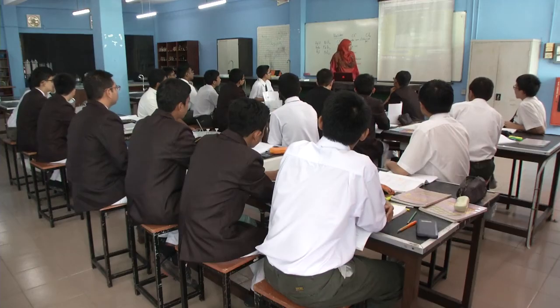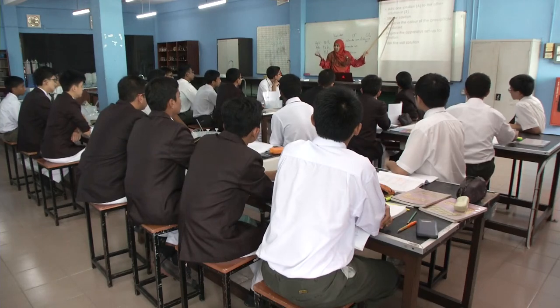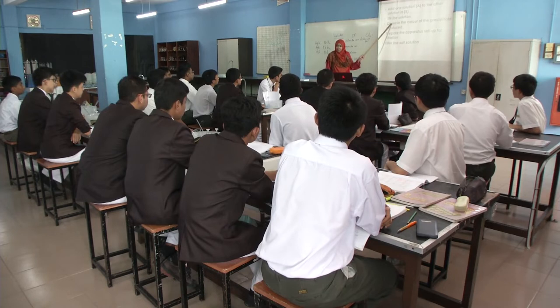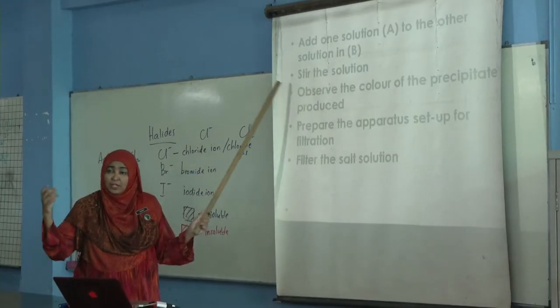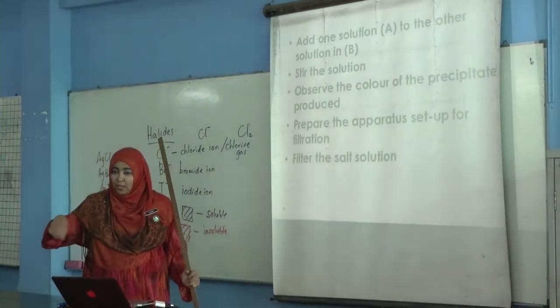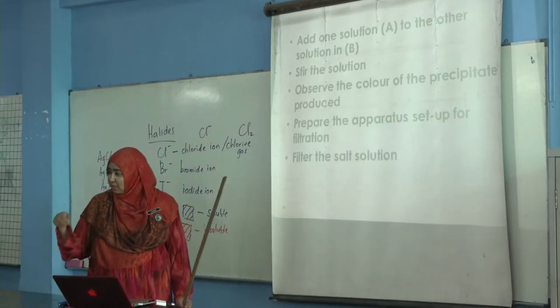So now what you're going to do is, in your basin, you have two different solutions. Okay? Now, you just add the two solutions together in a beaker and then stir. How long do you stir? Not to say dissolve. It's an insoluble salt. It's not supposed to dissolve. It's supposed to mix well. Okay, so stir about 1 minute, alright?